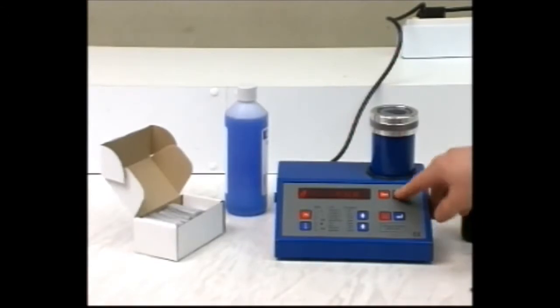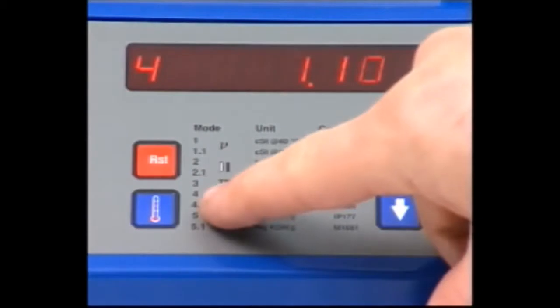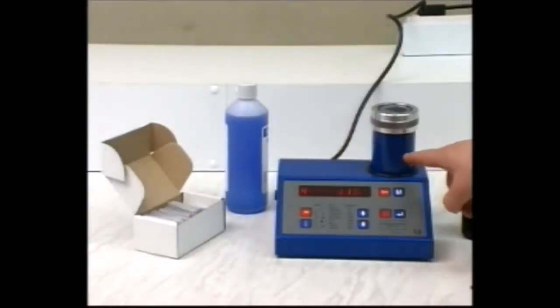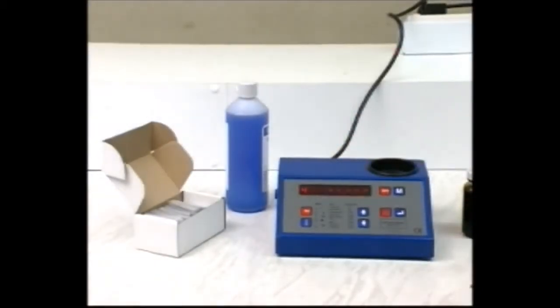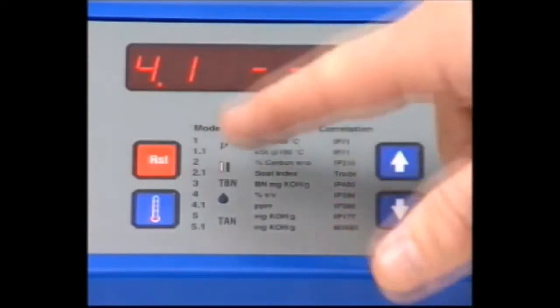There are two cells. For a standard cell test, select mode 4. Or if you are going to use a low range test, use the up arrow to obtain mode 4.1.